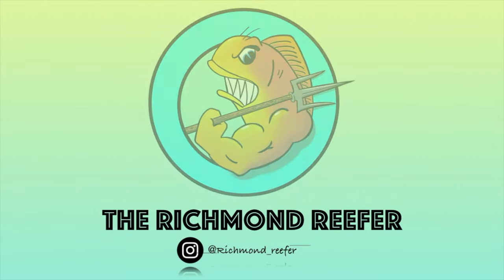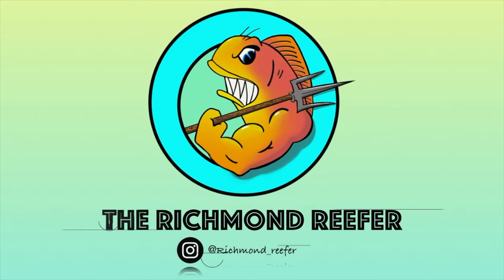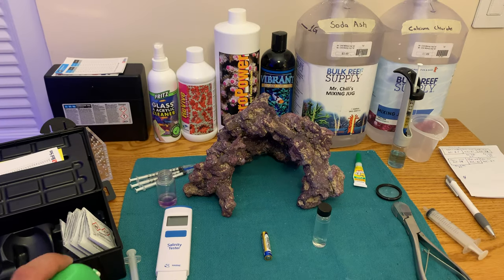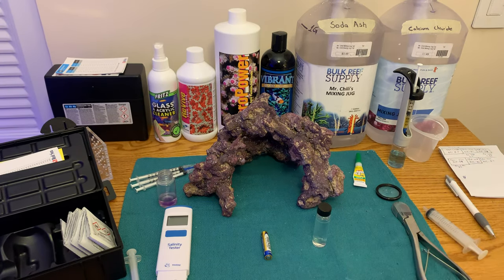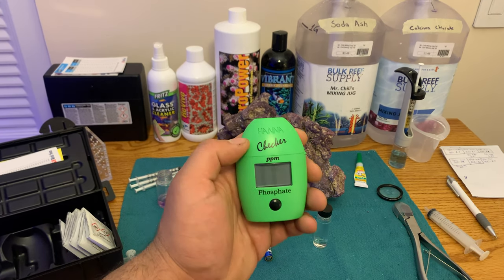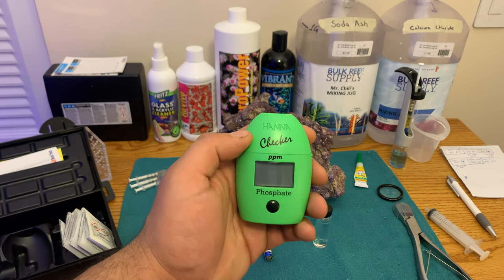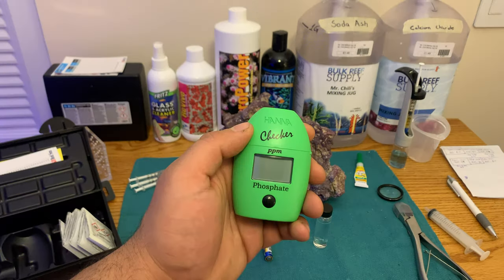What's up reef fam! In this video I got a tip to share with you guys I think you might like. I thought the Hanna phosphate checker failed me — but wait till you listen to this tip. So here we are at the fish water testing and coral fragging table that I use. Let's go ahead and start this video and talk about this phosphate tester by Hanna. I thought this thing failed me, and I'm gonna show you a clip right now.